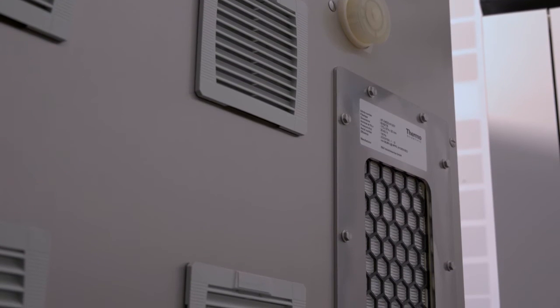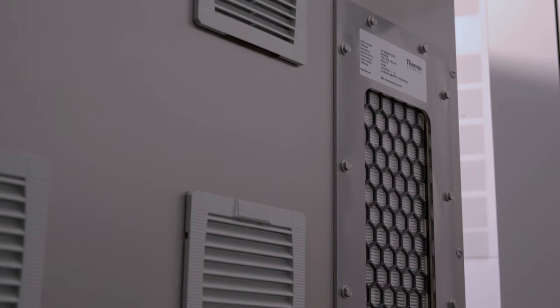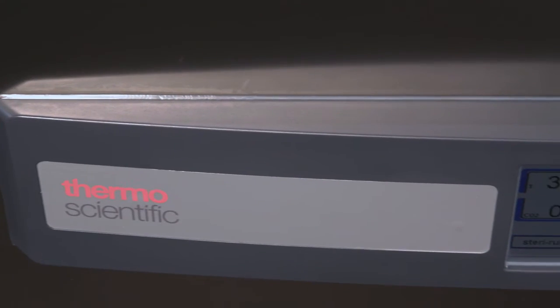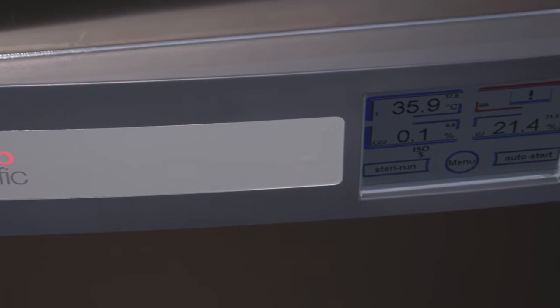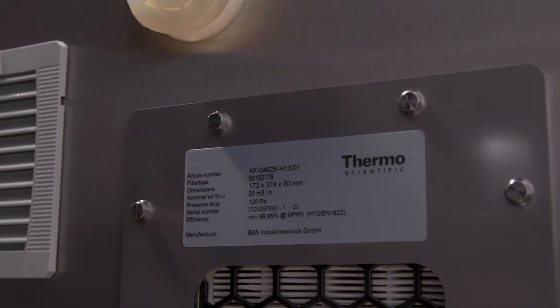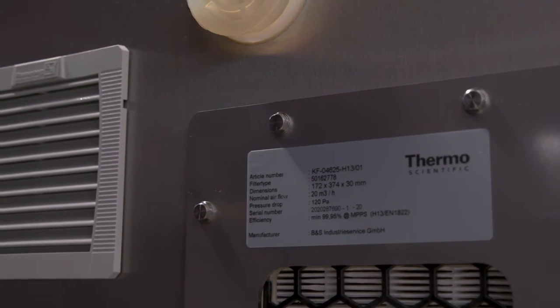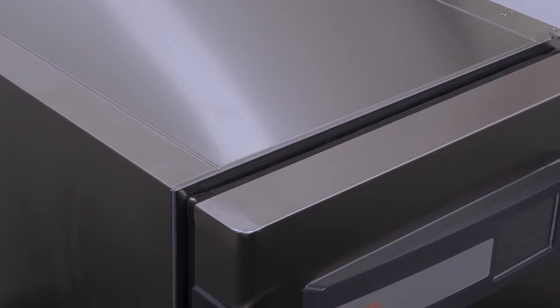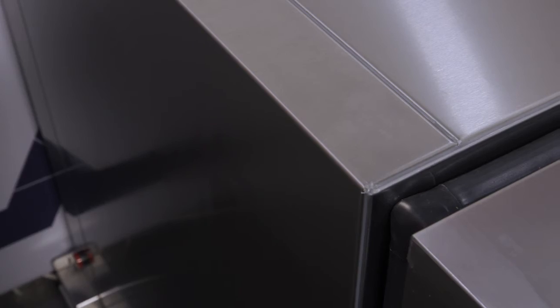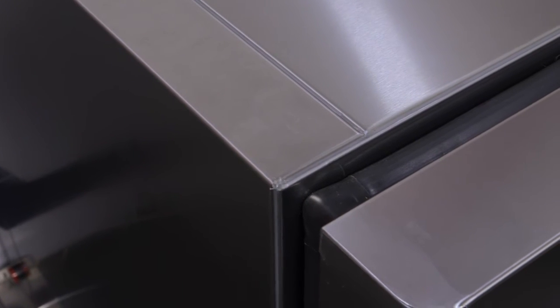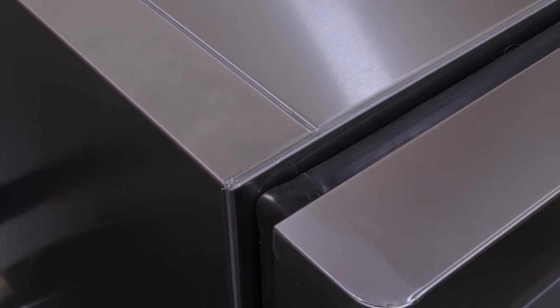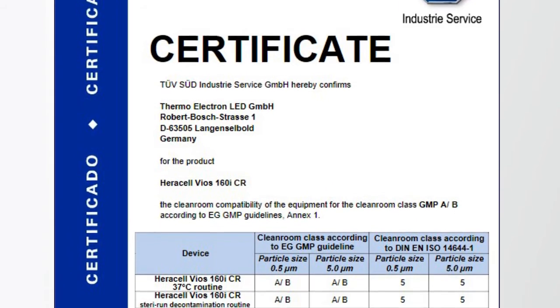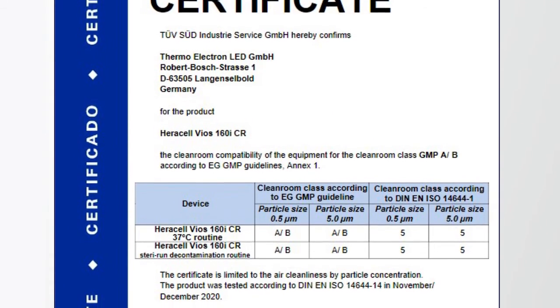This is really exciting because it's the first incubator to actively control the particulates that it releases into the external environment. So we're controlling particulates, we are making enhancements to improve compatibility with cleaning methods often found in these more rigorous settings, and we're also providing the necessary documentation to support the validation process.